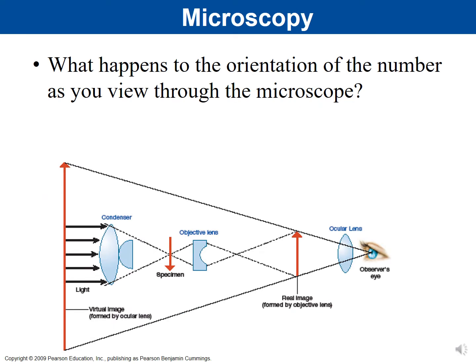So when we do this in the lab, what we would normally do is we would use a letter E slide to get you to be familiar with your microscope and how it works. And so what that would look like is, this is my slide. There's a part you can label. And on the slide would be a small letter E.